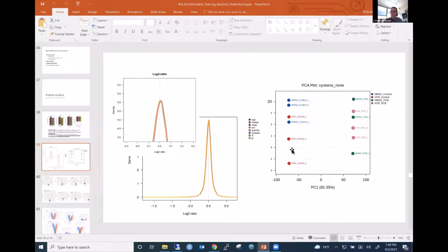And so you can filter out batch 2 to just have batch 1 and do the analysis within that batch, and that'll also get rid of the batching effect. Now, if you're trying to compare this sample to this sample, that's when you have to deal with batching effects. And really, it's a problem. It just is. I don't know that there's a good solid solution.